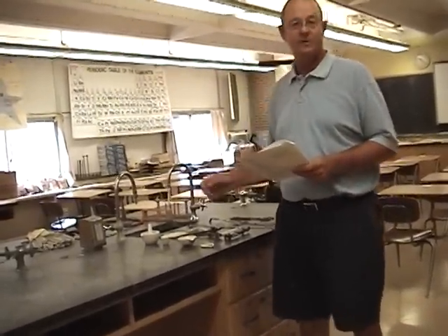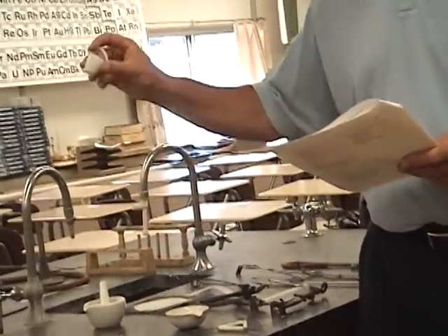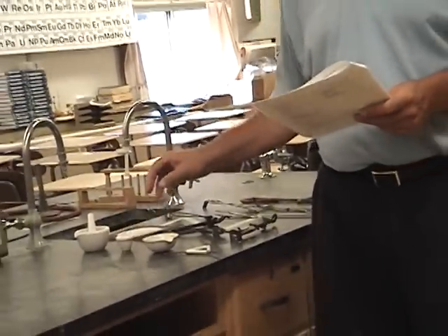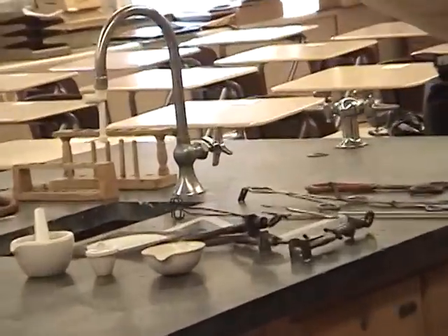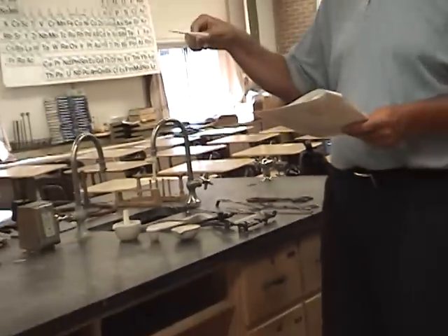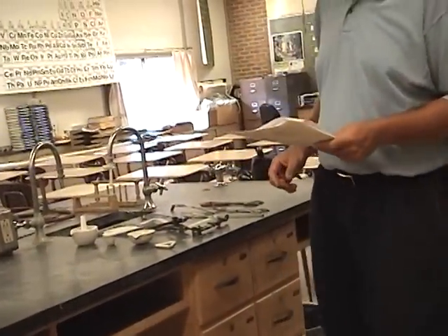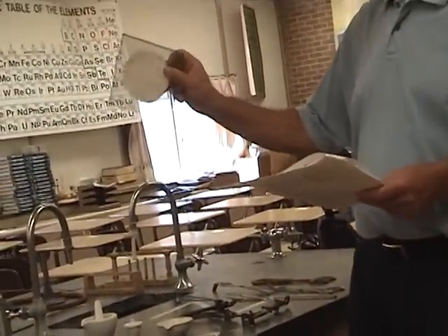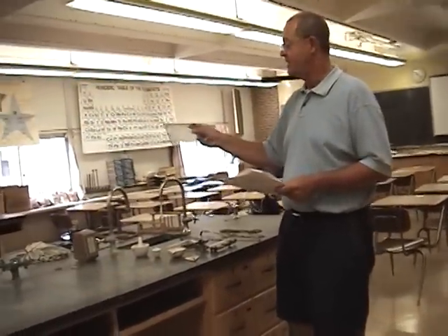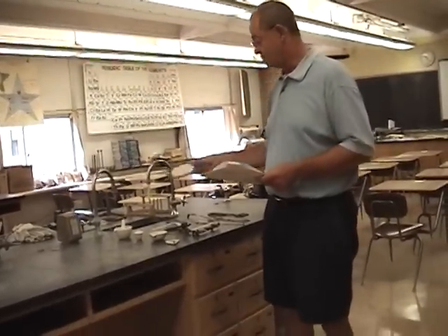I'll start with the old-time druggist mortar and pestle. We'll use that to crush up different things, especially pills, in the Wonder Drug lab. We have the crucible and cover, which is basically a fancy name for cup and lid. We also have an evaporating dish and a clay triangle. The clay triangle will be used when you want to put something over a flame — over the Bunsen burner flame. Those are all ceramic or clay in nature. We have the asbestos wire gauze — you can see the asbestos impregnated into the wire gauze. We'll put that over the Bunsen burner as well. Asbestos is dangerous and has been removed from buildings, but this small amount we use won't hurt us, though it can cause lung problems.